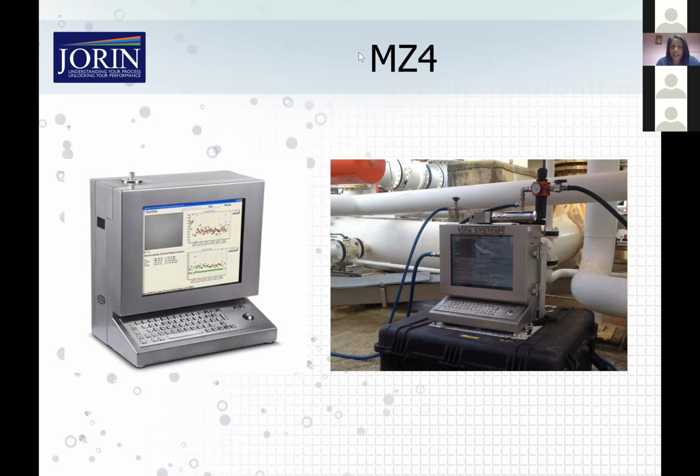So if there's any surges or slugs or flow in that range, then it doesn't matter at all to the ViPA. The ViPA can still see, and we will still report higher concentrations and larger particles. The screen will obviously go a bit darker, for example, but in terms of ViPA analyzing it, there is no actual concern or issue. We will be able to monitor and analyze increases and decreases in concentration, and the same for particle sizes, again provided it is within that range of 0 to 2,500 ppm.